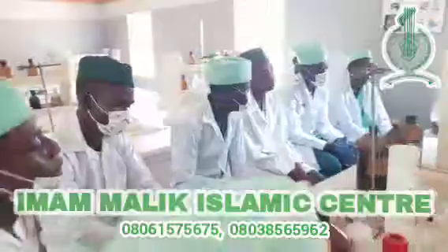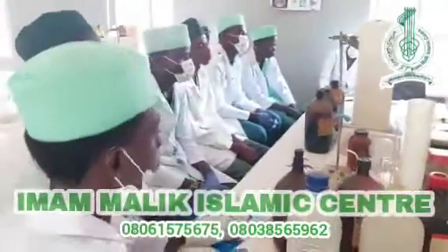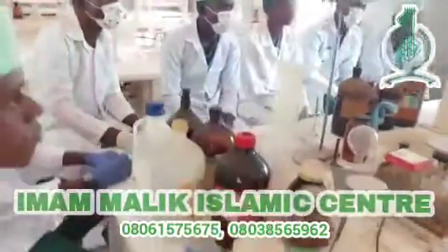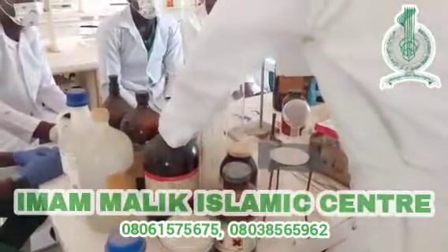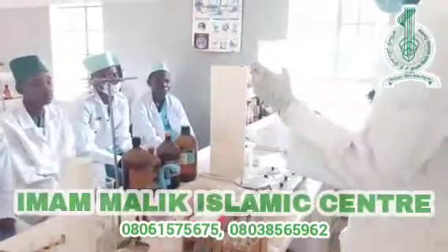Volumetric flask. And we also have some common laboratory apparatus, like the beakers. We all know what a beaker is. So this is a very good example.